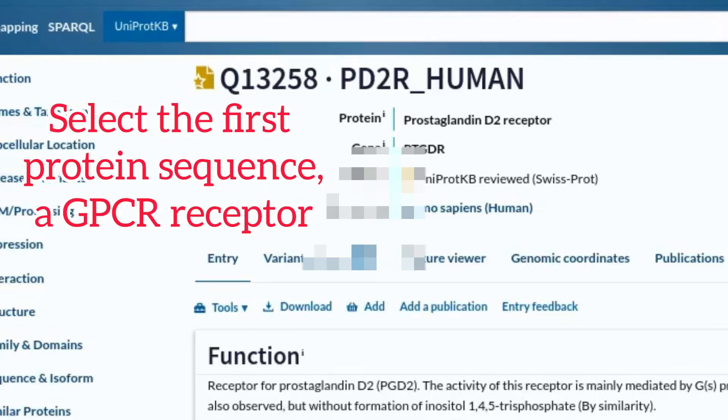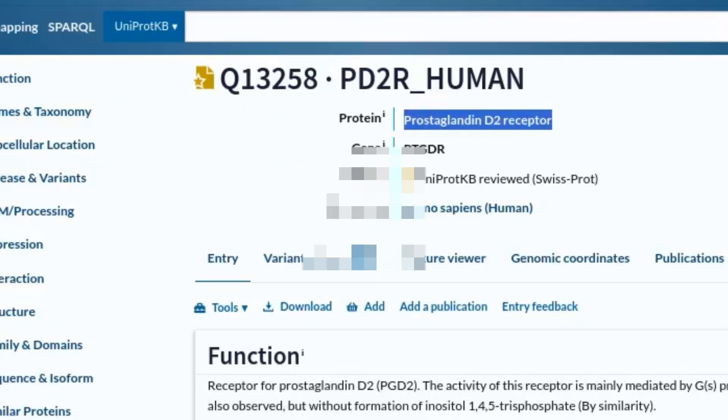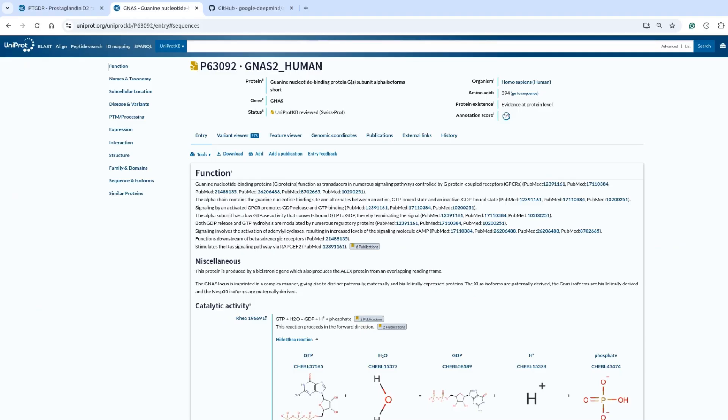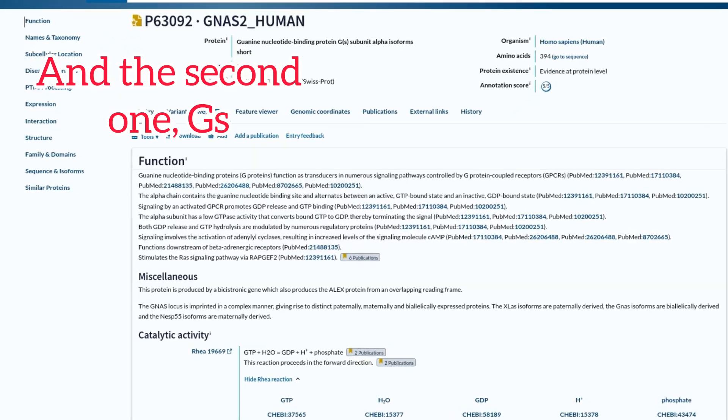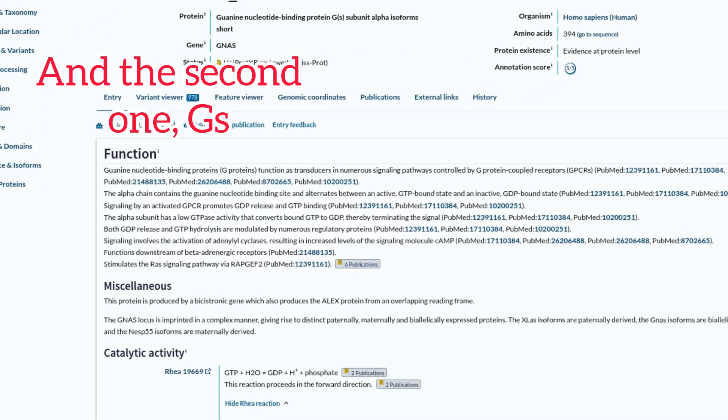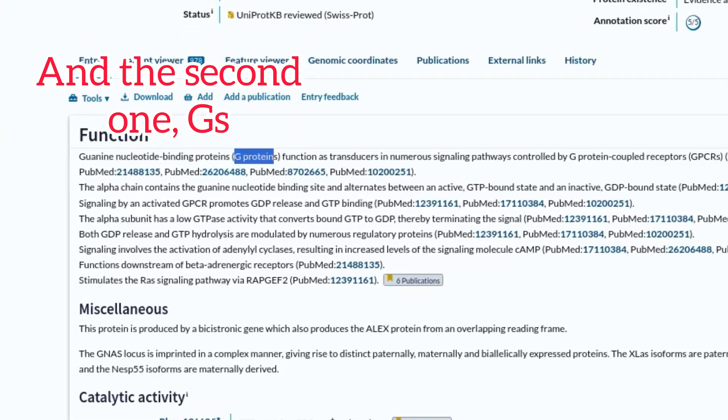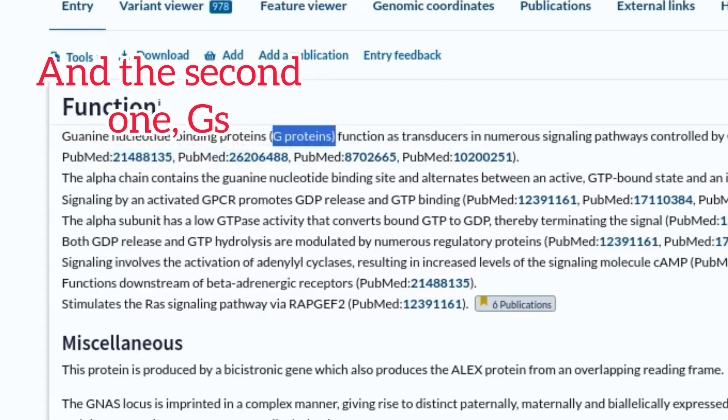Select the first protein sequence, a GPCR receptor, and the second one, a G-protein GS.